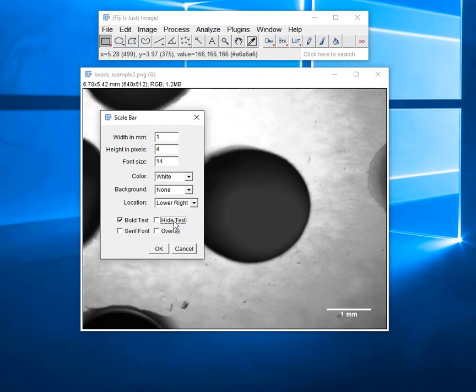So I just don't even put the text in the scale bar, right? Just remove it, and that way it's only the scale. What we do with the text is then in the figure legend below the picture, you just say scale bar equals one millimeter, and then everybody knows.